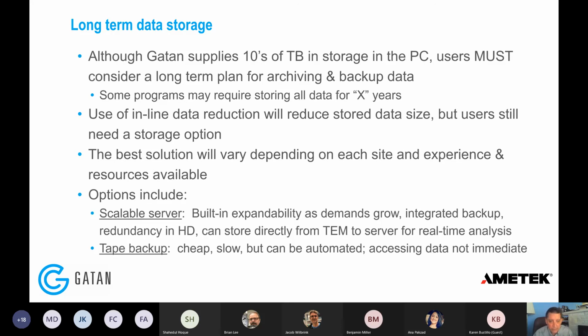You can get a scalable server. The example I said before, you go out and buy 50 terabytes of hard drives. Doesn't really cost that much, a few $1,000s, and it's expandable. But that doesn't really necessarily solve the backup of your data solution. It might not solve redundancy, right? If you lose a hard drive, do you have a backup copy? So there's still challenges remaining, even if you just every week go on Amazon and buy another 10 terabytes.